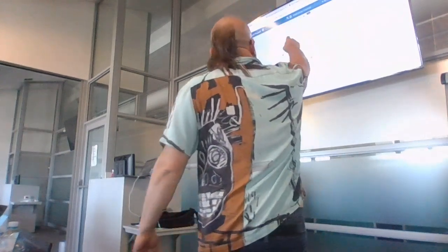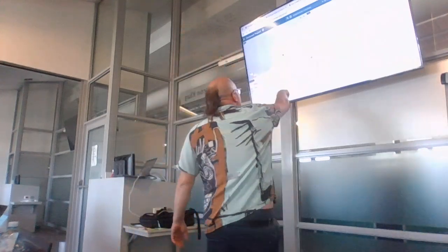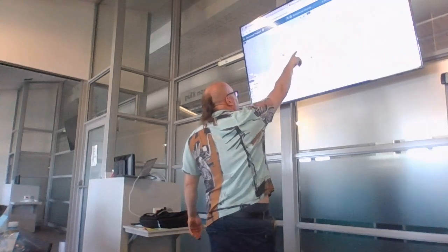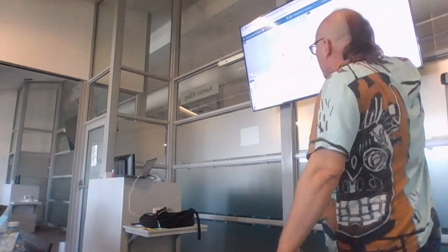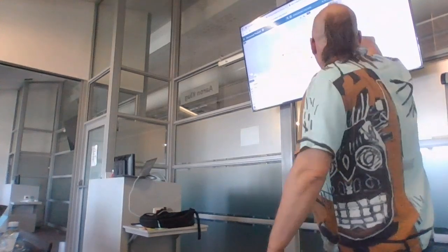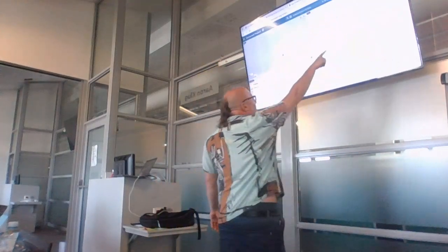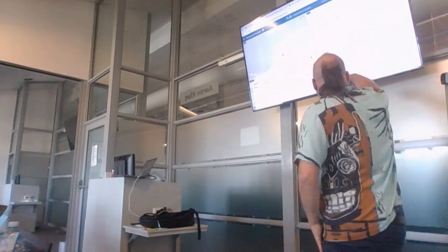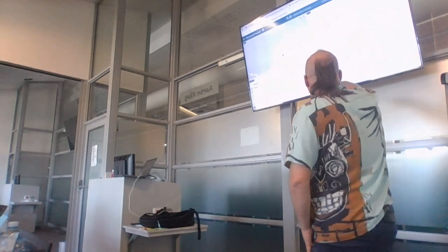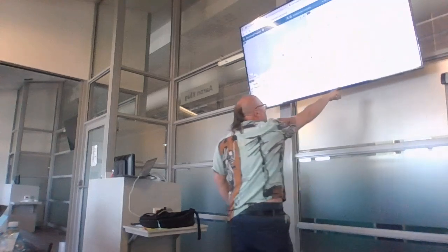Then, and if we look at it in time, the order goes, the 253 is before any of these other ones, 373, 370. But then later on, more divergent, remember these were more divergent from the reference, 364 and 260, okay? So 260, as we can see from the color, is an environmental sample. 364 is a clinical sample, okay? And 260 is collected in 2015, 364 in 2017, okay?